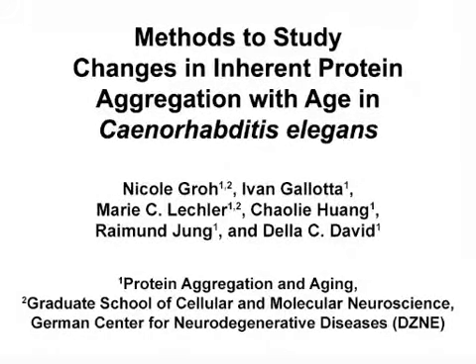The overall goal of this experiment is to detect changes in protein insolubility with age in C. elegans, and to evaluate how targeted gene knockdown influences this aging marker. This method can help answer key questions in the field of aging and proteostasis, such as why organisms fail to maintain a healthy proteome with age.